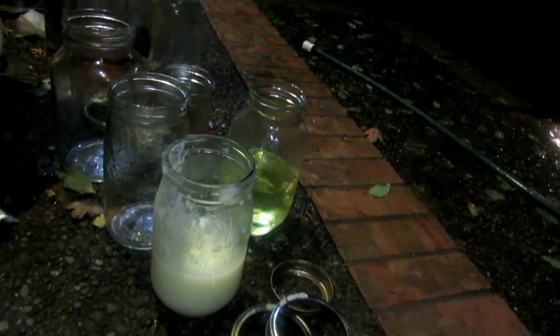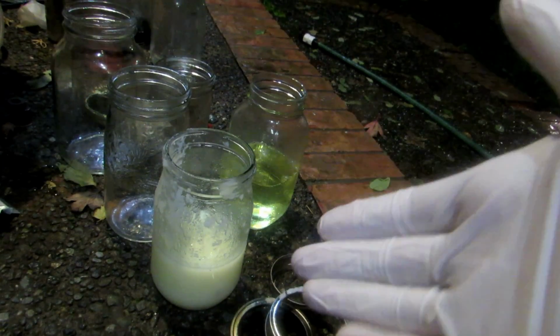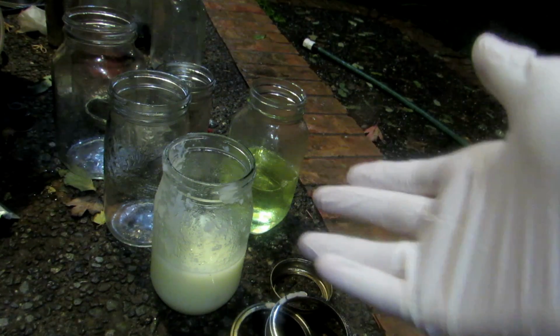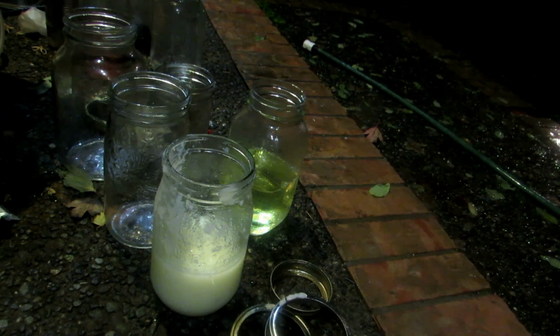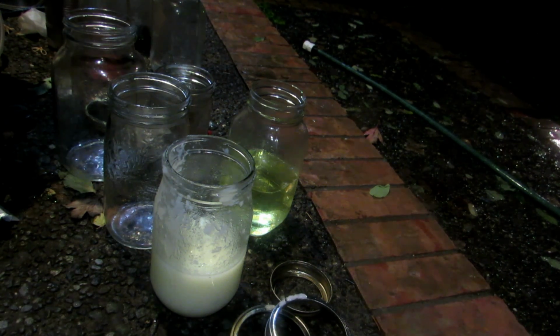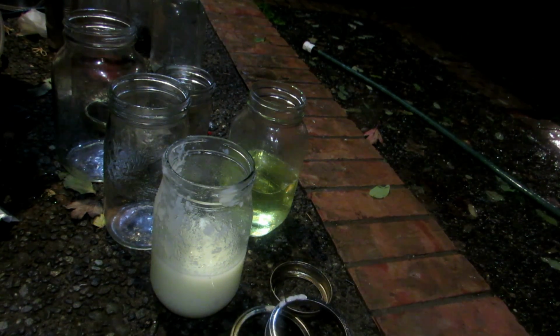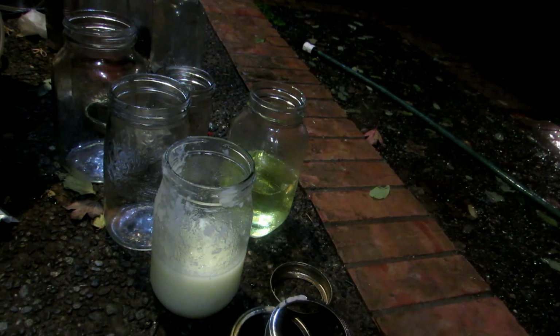Okay, so after removing all that silicic acid, we're left with 2 containers. Of course, our silicic acid container, which has been filtered off, and then our waste liquid, which mostly contains sodium chloride and a bit of hydrochloric acid, and perhaps still some sodium silicate, which could be converted to silicic acid. And a way to test that is just to drop in a bit more hydrochloric acid, and if any more precipitates out, then you know there's more.